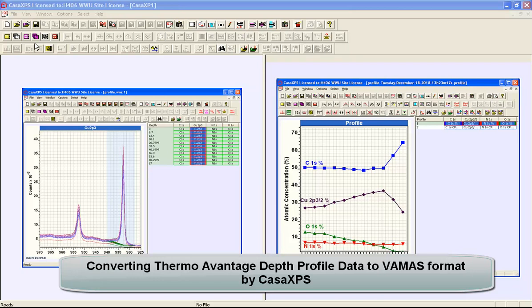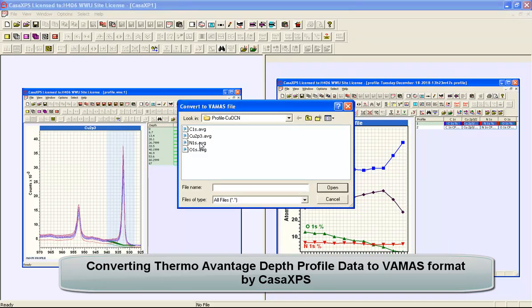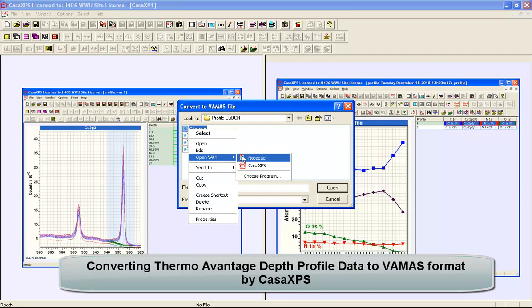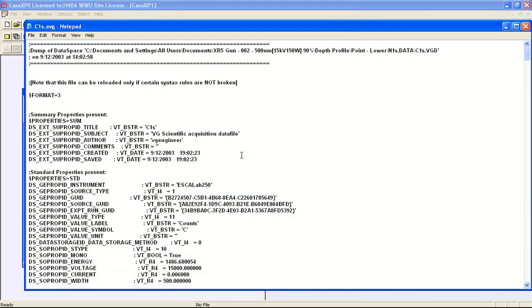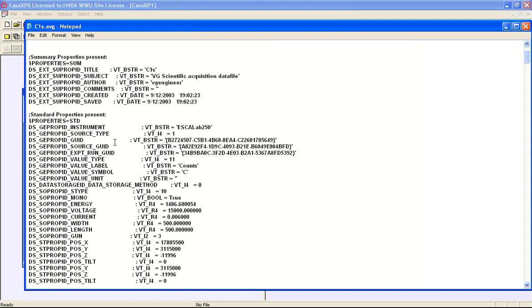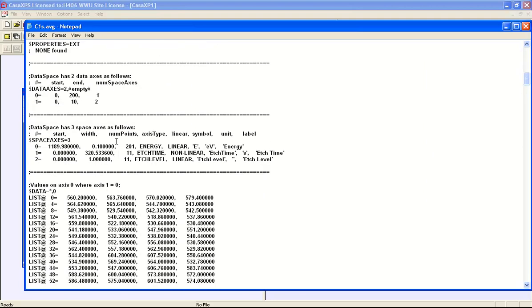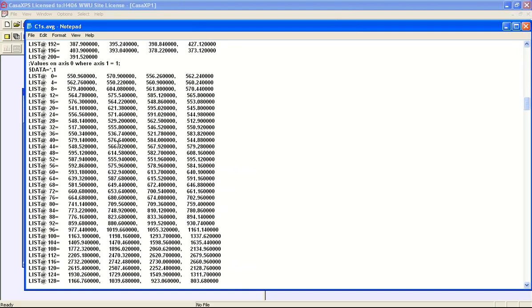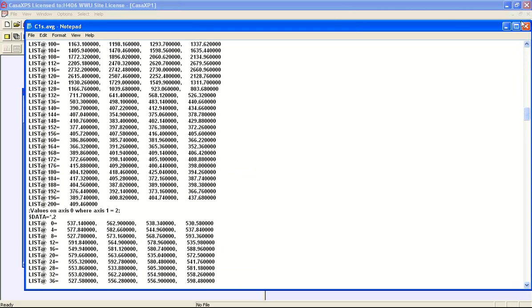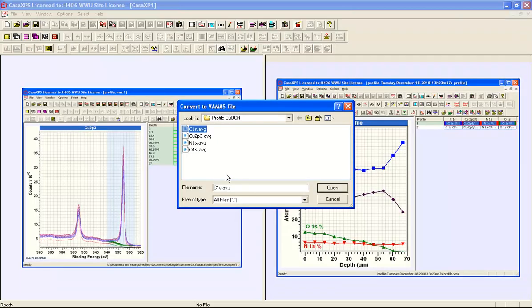A depth profile experiment from Avantage is exported as a set of AVG files, and these AVG files contain information, one for each element that was monitored during the course of the depth profile. The original C1S.VGD file is the binary file from Avantage, and when exported it produces a file that contains header information describing the spectrum in question, and then a set of measurements that can be converted to form a depth profile VAMAS file.